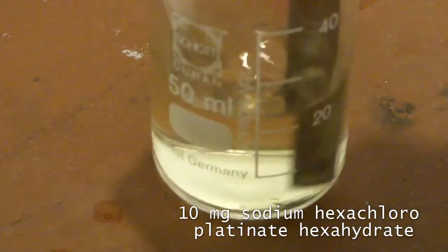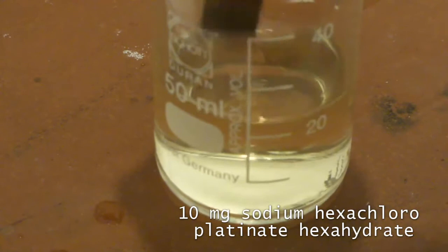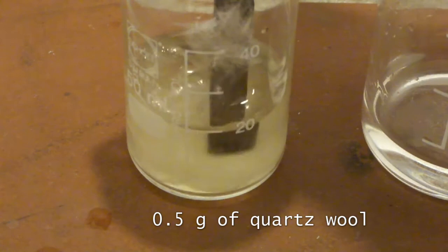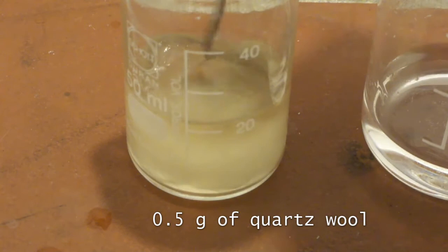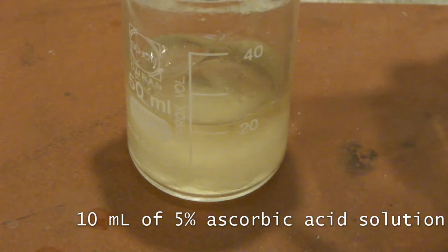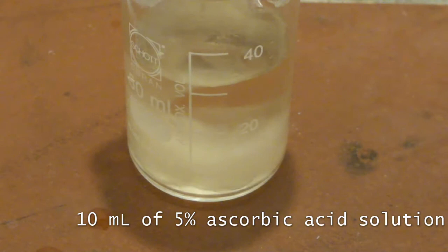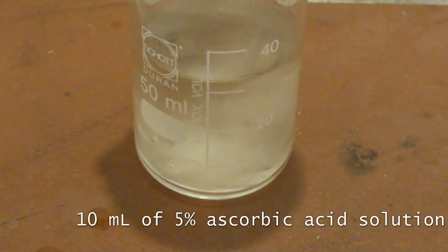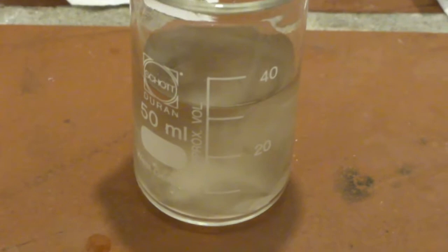Dissolve 10 mg of the sodium hexachloroplatinate hexahydrate we just prepared in 20 cubic centimeters of water. To this, add 0.5 grams of a well-cleaned piece of quartz wool. Then, add 10 cubic centimeters of 5% by weight ascorbic acid in water. Soon, we can see very fine, black particles of platinum precipitating from the solution onto the quartz wool. Let this stand overnight.